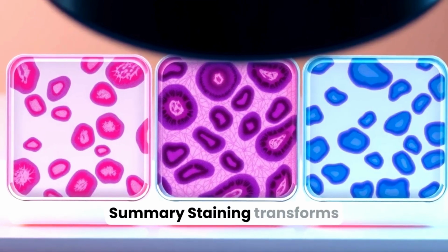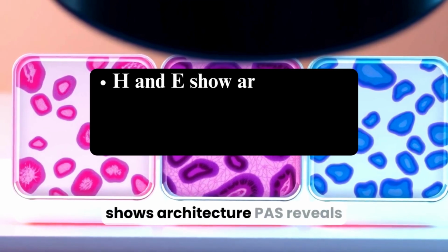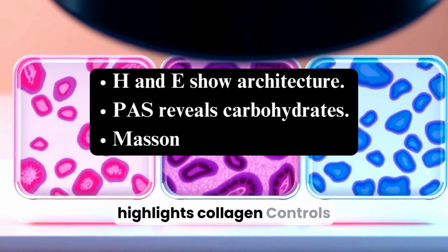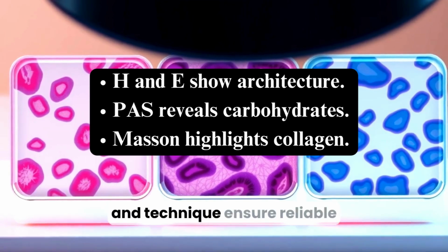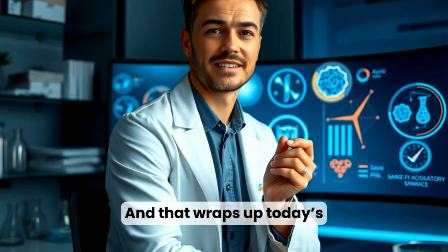Summary: staining transforms transparent tissues, H&E shows architecture, PAS reveals carbohydrates, and Masson highlights collagen. Controls and technique ensure reliable results. And that wraps up today's topic.